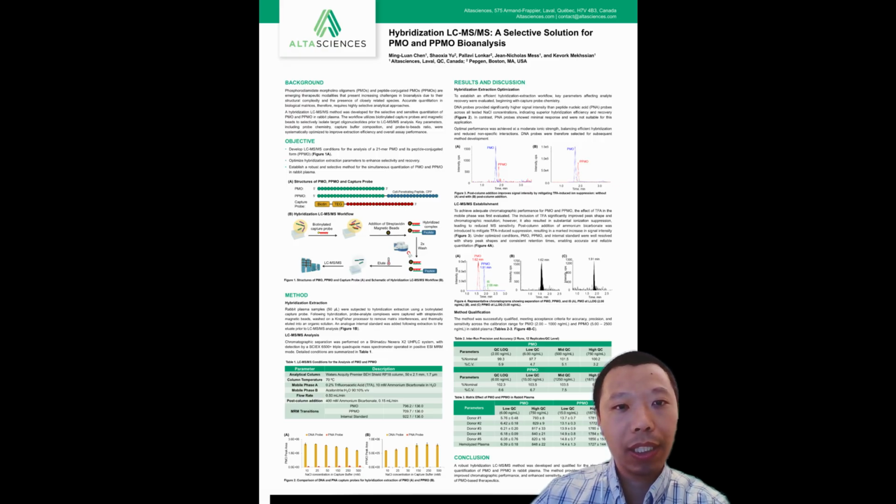As a result, these compounds behave differently in LC-MS analysis, which complicates both extraction and detection. Given these challenges, a more selective and robust analytical approach is required.